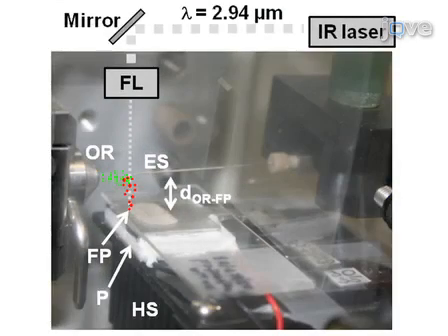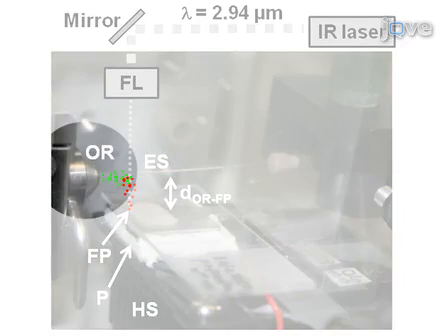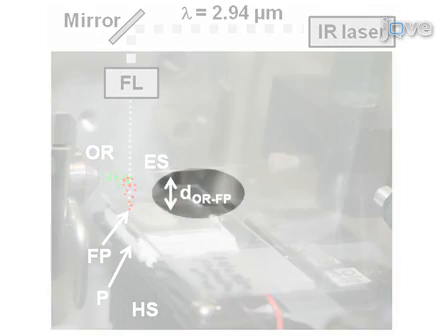A portion of the particulate matter expelled during mid-IR ablation coalesces with the electrospray to yield charged droplets seeded with molecules and ions of the sample. The ions released from these droplets are analyzed and recorded by the mass spectrometer, the orifice of which is shown here. The LAESI setup is configured before starting the experiment.